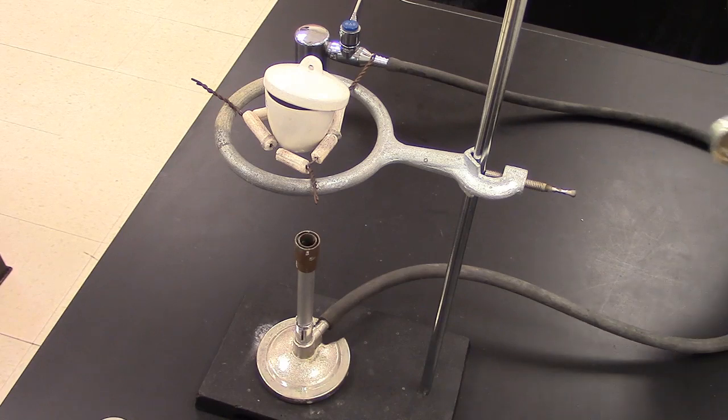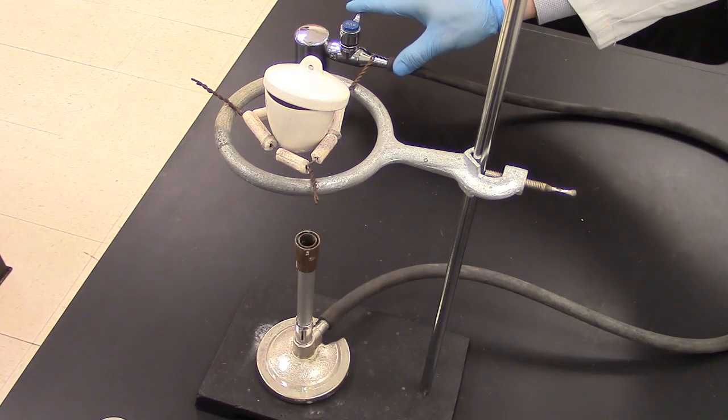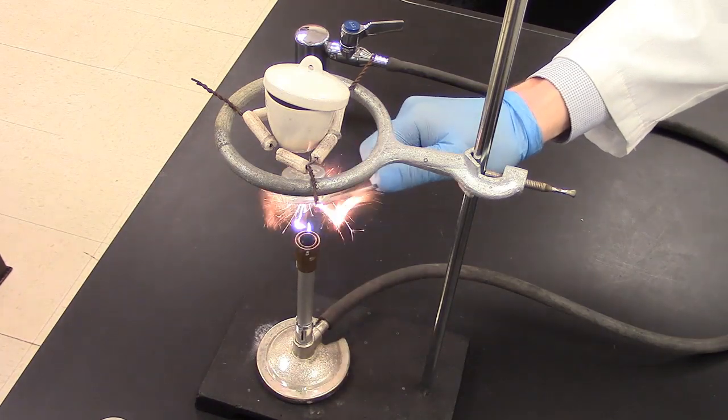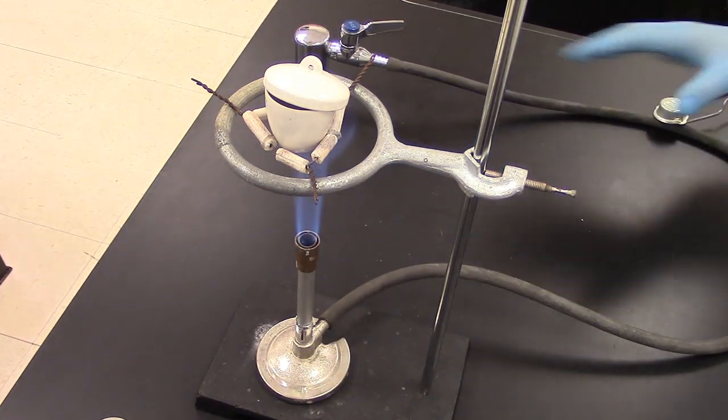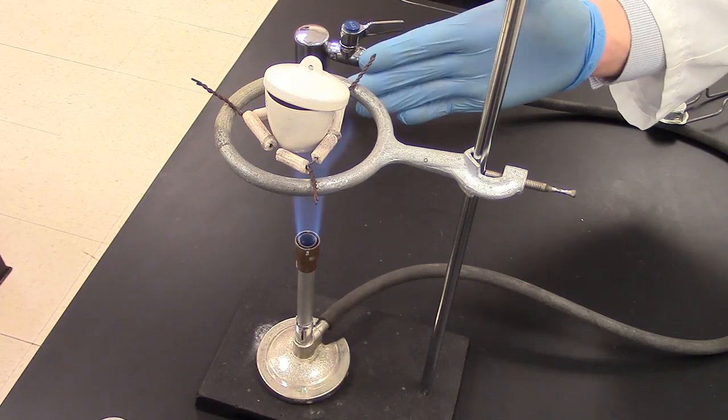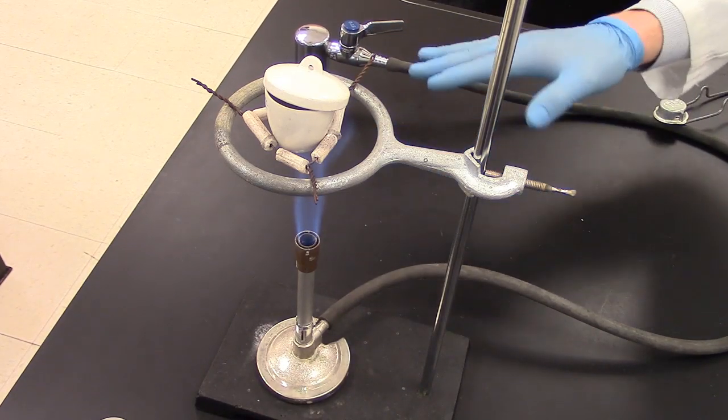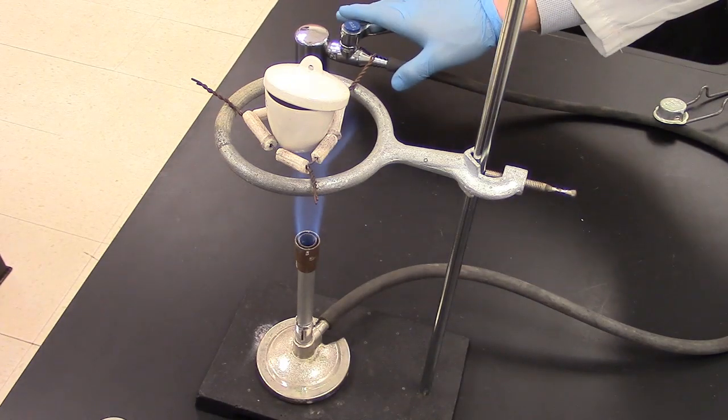So my next step is to go ahead and light the Bunsen burner. I'm going to turn the gas on at the valve and light it with the striker. Now you want your flame to be just touching the crucible here. If you notice your flame is not quite there, go ahead and turn it up with the gas valve.